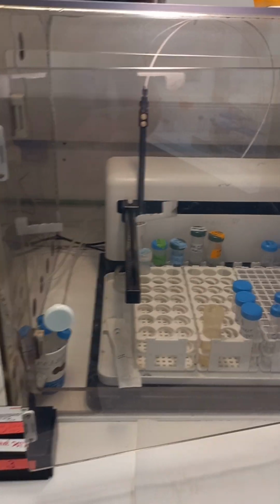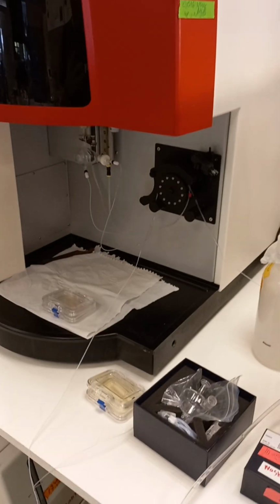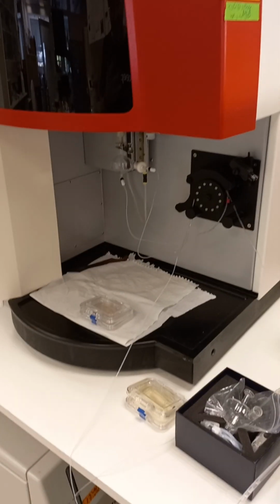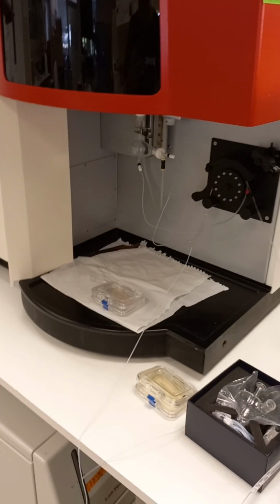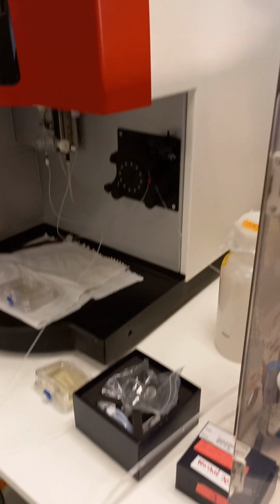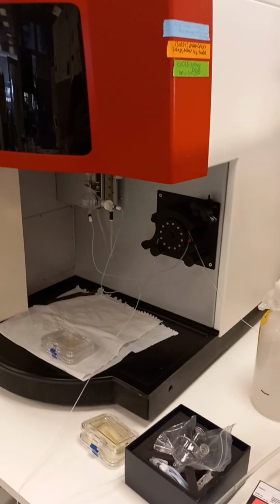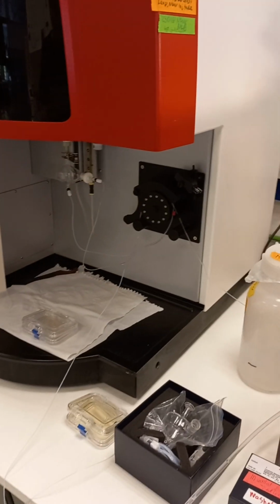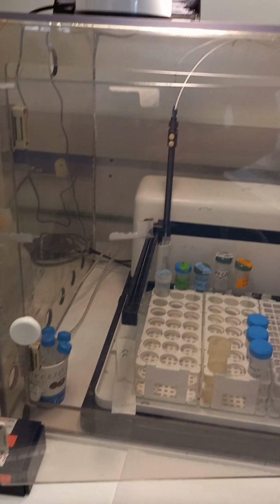If you run highly concentrated samples and after that you washed all your system, put new tubes, and you run a blank, and you still see what I call this tail. You see the rest of the low concentration of your element, but still it interferes. It is not possible to calibrate the instrument to measure very low concentration if we have 0.5 ppm, for example, of sodium or potassium, even this. So for that, because we can't just replace this tube, first of all, it's a bit expensive and it is not possible on a regular basis.